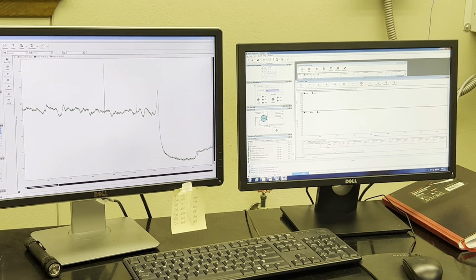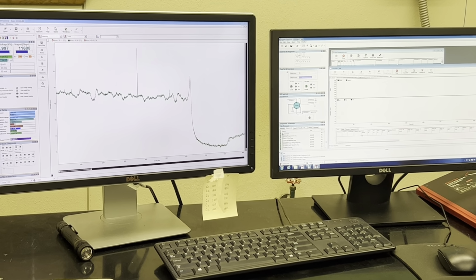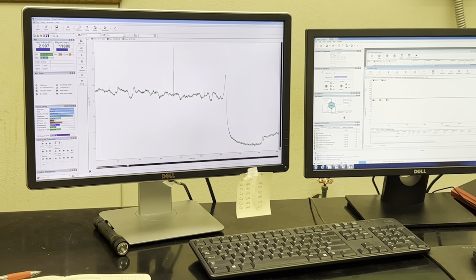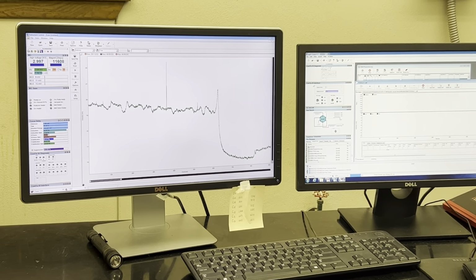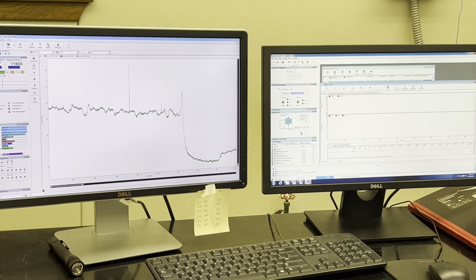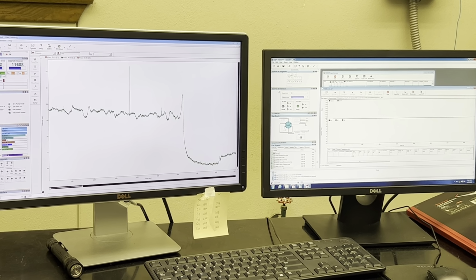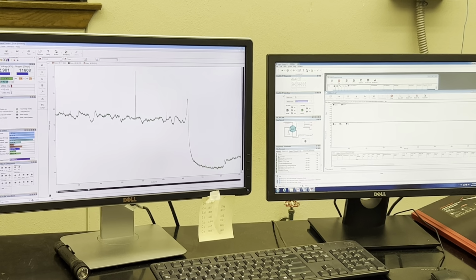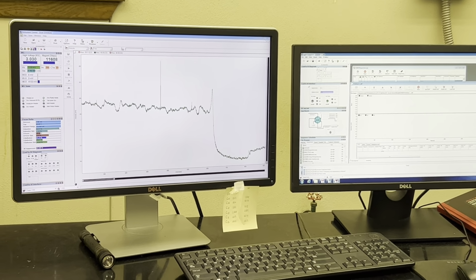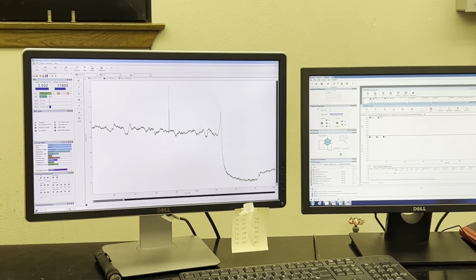Your water background came down to 5 volts and it was still going down, so that's great, without the analyzer heater on. So it's looking good. I think after just a few hours, like the 12 hours tomorrow, it might be fine. Do you want me to do the analyzer heater overnight? Yeah, set it to 12 hours. What is today, Wednesday? Yeah. On Friday, before you leave, I'd set it for 72 hours or something like that.